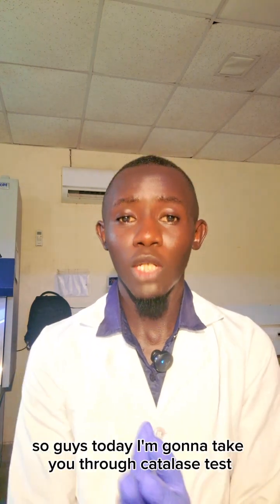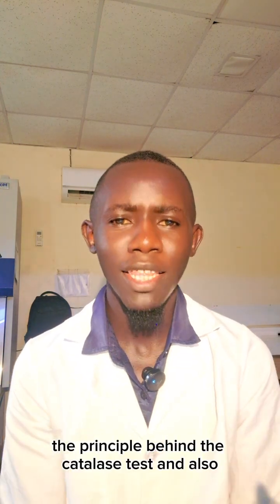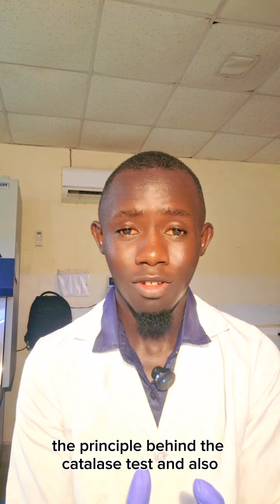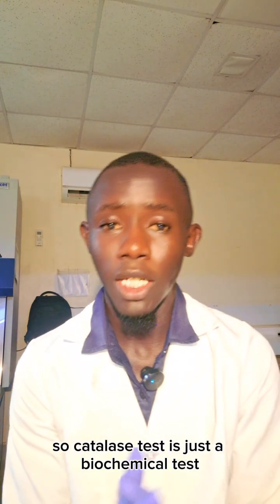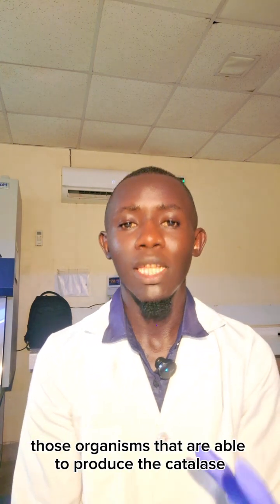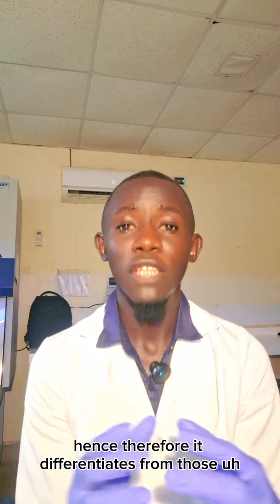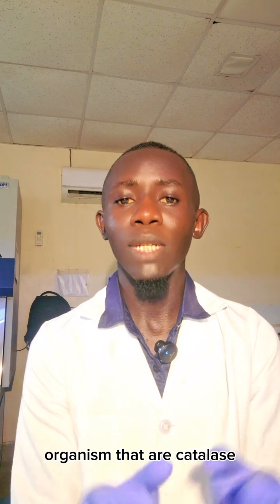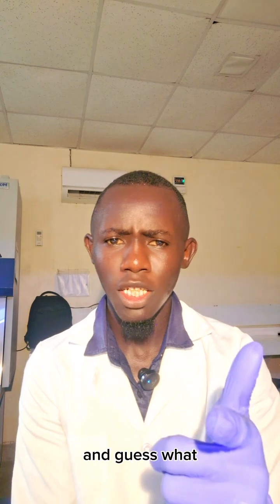So guys, today I'm gonna take you through the catalase test. We're gonna discuss the introduction, the principle behind the catalase test, and also the bacteria that are able to produce this catalase enzyme. Let's start. The catalase test is just a biochemical test used to identify those organisms that are able to produce the catalase enzyme. It differentiates organisms that are catalase positive from catalase negative organisms.